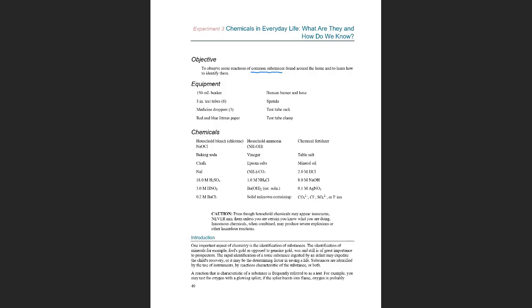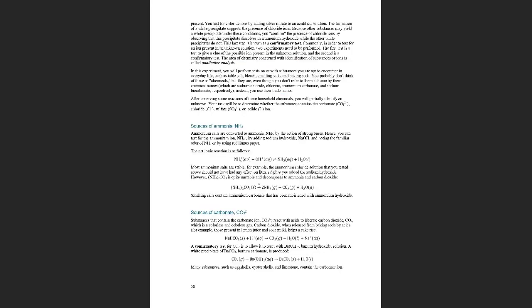One thing, this whole experiment is about qualitative analysis. We are only interested in the identification of different substances or ions. We are not interested today in the concentration, just qualitative analysis.